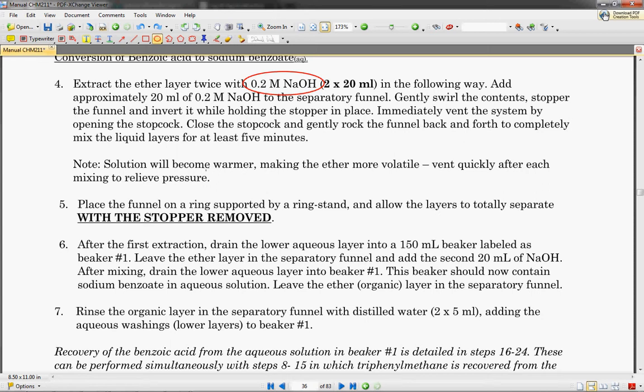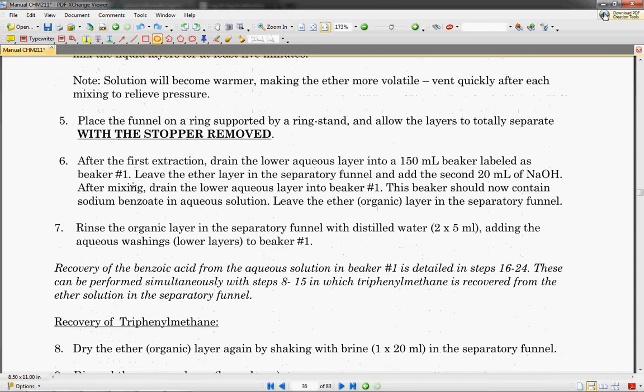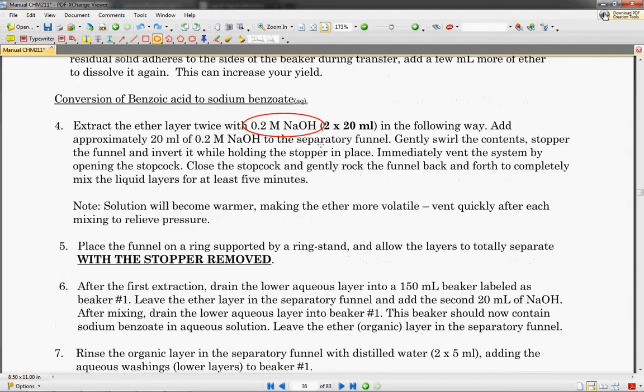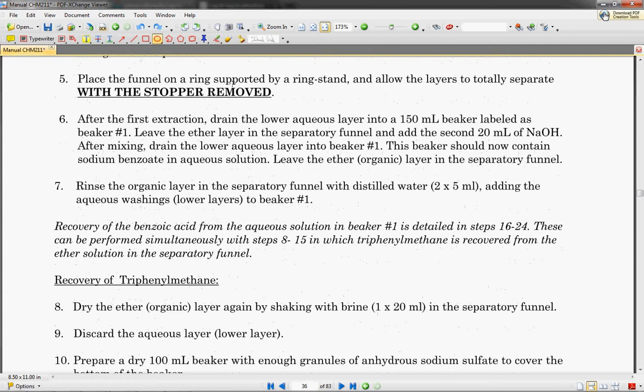So let's keep that in mind and make sure that when you mix the ether, you're careful to vent that extra pressure. So you're essentially going to make those two layers, one of water and sodium hydroxide, and the other of the ethyl ether, which will be your organic compound, as the top layer.